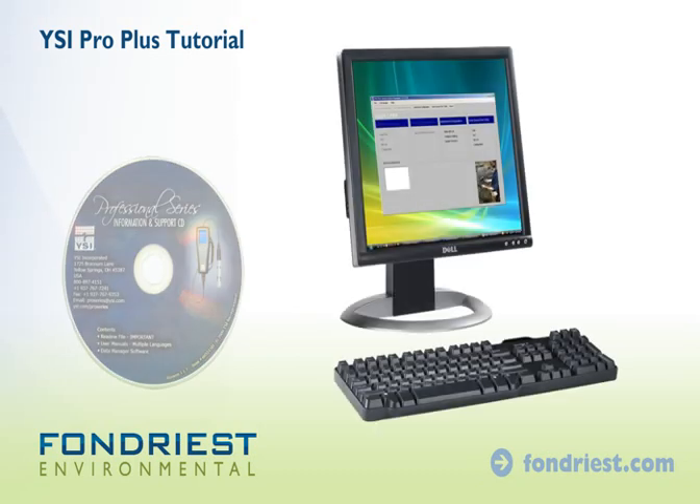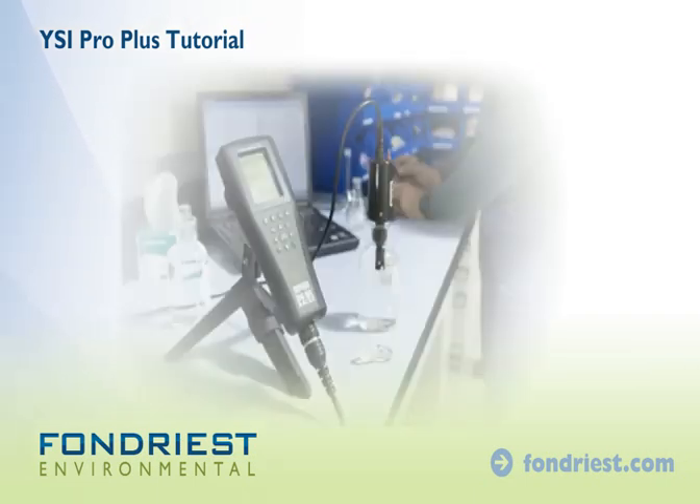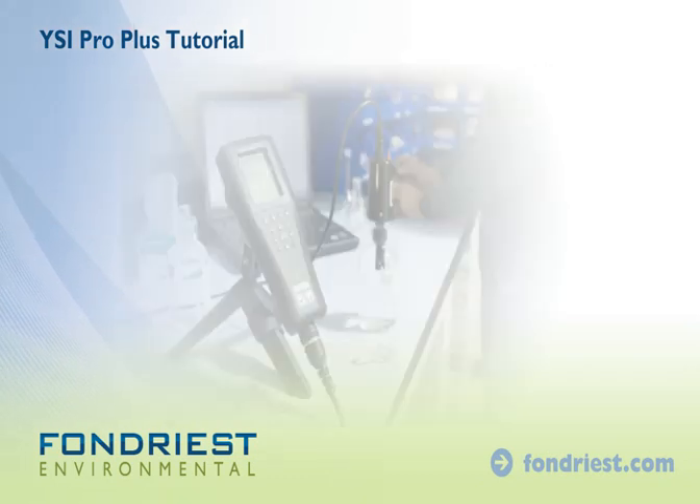With the included software, data is quickly processed. The convenience and flexibility of the YSI Pro Plus will simplify fieldwork and ensure quality data. Contact a Fondriest Applications Engineer for more information.